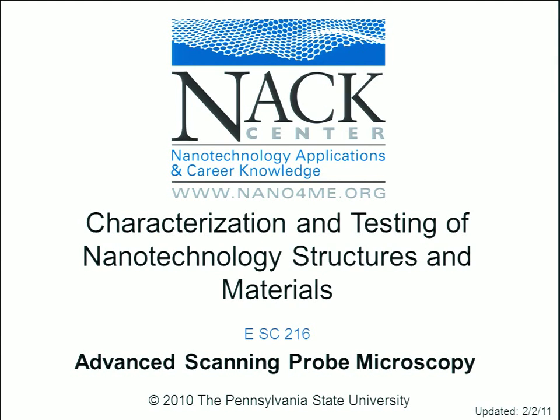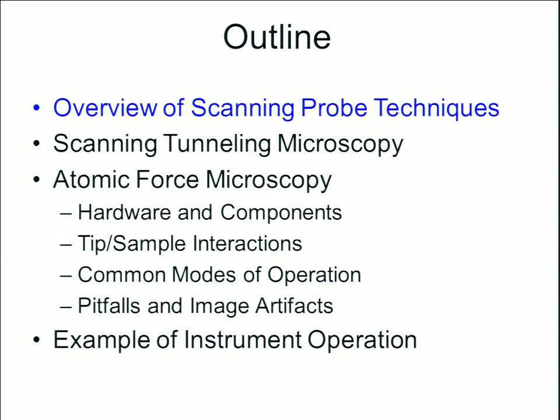So this will be Lecture 1 in our Characterization and Testing of Nanotechnology Structures and Materials section. Our outline for today's topics will be an overview of scanning probe techniques, scanning tunneling microscopy, then we'll go into AFM or atomic force microscopy, and finally an example of instrument operation.